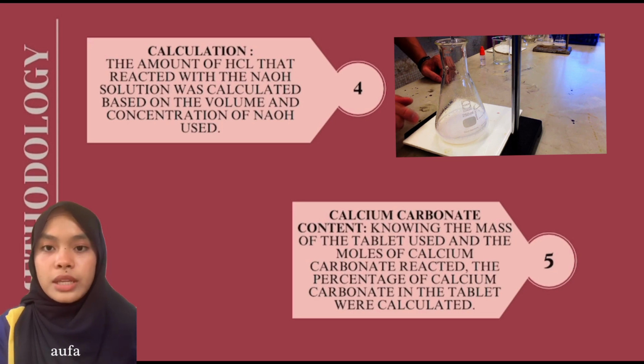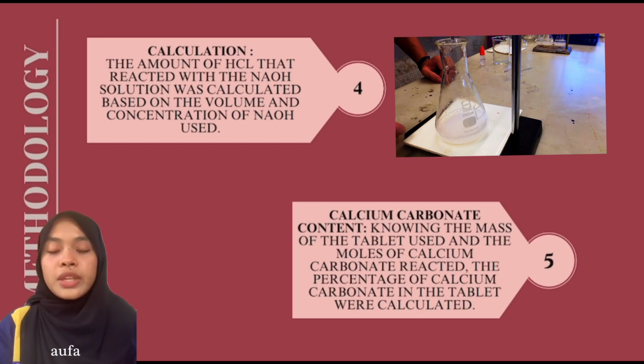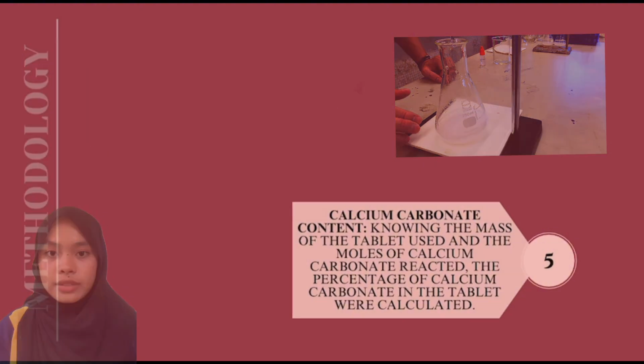Knowing the mass of the tablet used and the moles of calcium carbonate reacted, the percentage of calcium carbonate in the tablet is calculated. These methods allow for the determination of the calcium carbonate content in the antacid tablet, providing valuable information for quality control and dosage recommendation.